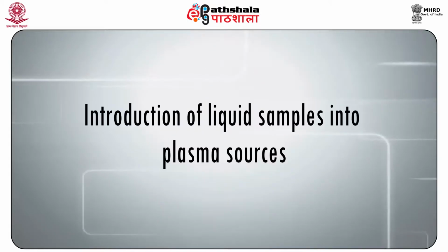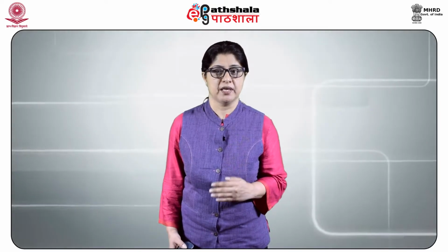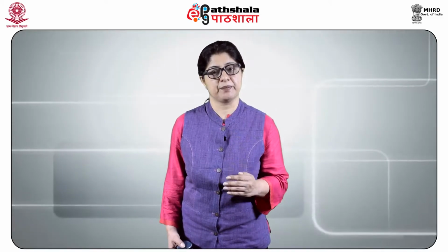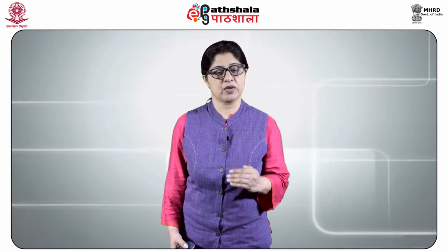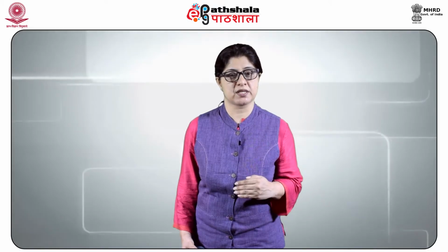A direct current plasma requires about 1 kilowatt of power and consumes about 8 liters per minute of welder's grade argon. Introduction of liquid samples into plasma sources. Liquid sample introduction is equally important in the plasma method. In all cases, the analysis can be only as good as the sample introduction. However, optimum conditions for the sample introduction into plasma sources differ markedly from those for the flame atomic absorption sources.